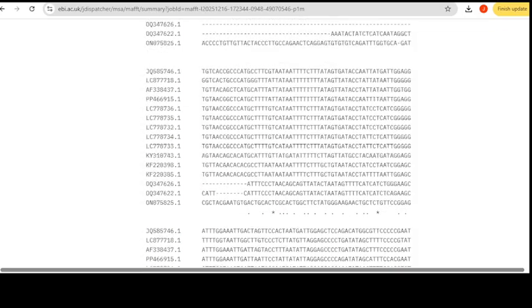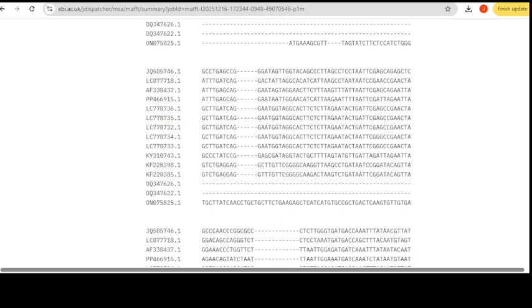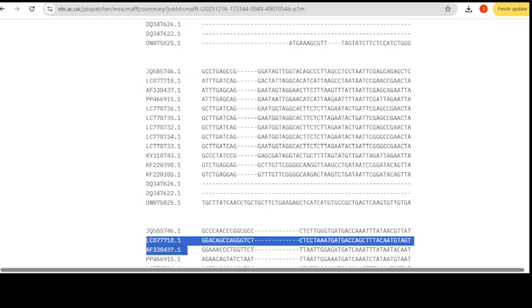All these are starting from here, going to the end, and then the sequence jumps back down here again. If you look at this name, it is the same as this one. This one starts from here, goes here, and comes back down here. The same is the other sequence. It cannot fit all the sequence to the right side all the way, so it comes back down, all of them together, because they're aligning with each other. They are matching sequences here.